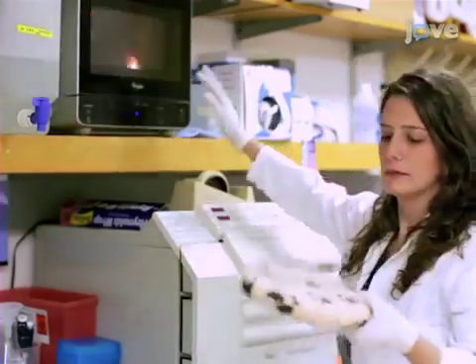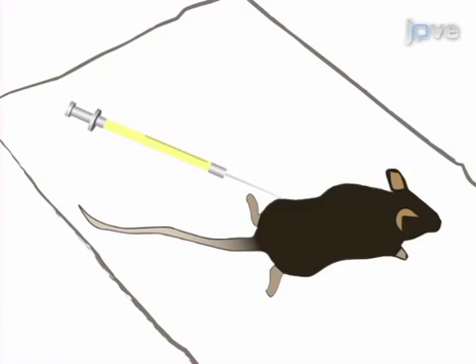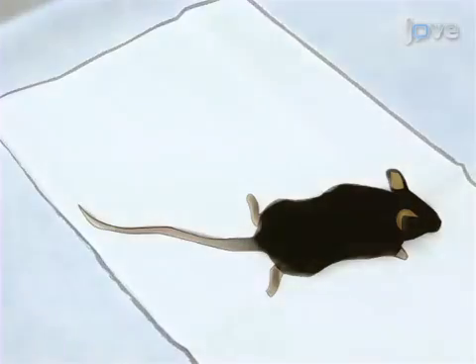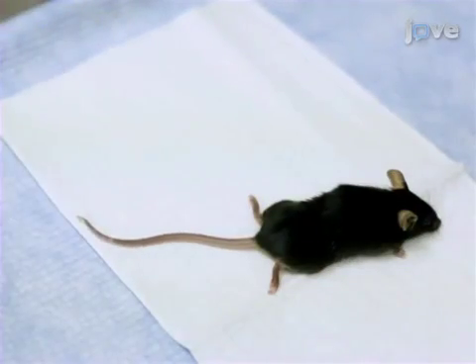Place a microwaved heating pad or an electric pad on the stereotax. After injecting the mouse with an IP injection of a ketamine xylazine cocktail according to the text protocol, perform a tail pinch to check the level of sedation.